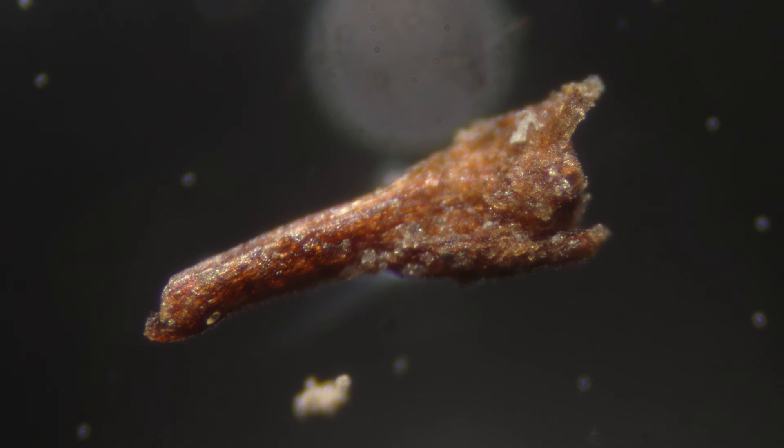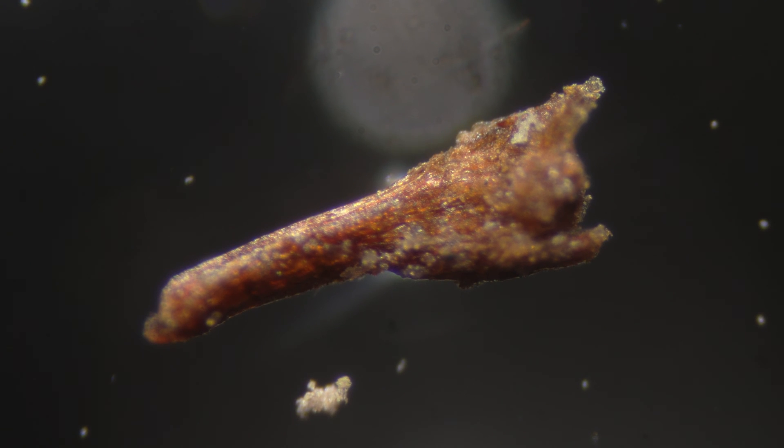What I find really cool is not only can you see the fibers — I don't know if that's wood or what — but you can also see the skin cells and the way that it was in her finger. It was actually in the opposite direction you think it would be. The wide side was in her finger and that narrow little pointy side was facing out. Wow, that's cool — you can see all the skin cells. And if you look in the lower left-hand portion of the screen, those are also skin cells.